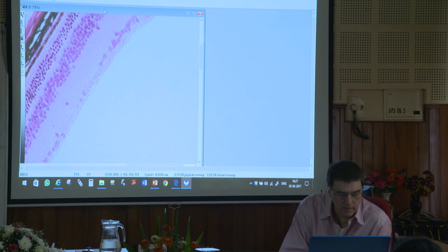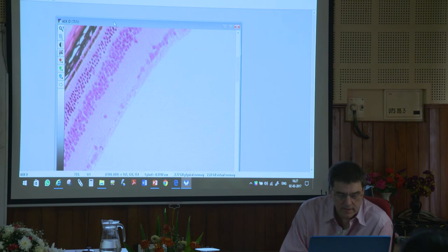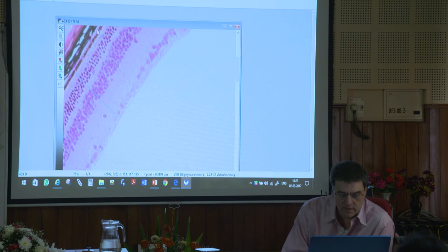So we looked at this the other day, right? So what kind of stuff could we do on here? A lot of times I get something like retina thickness. People want to know how thick the retina is. So remember we talked about one way we could do it? We could just draw a line. We could draw another line, right? We could draw another line. We could draw as many lines as we want.